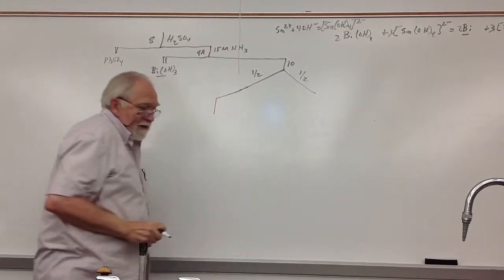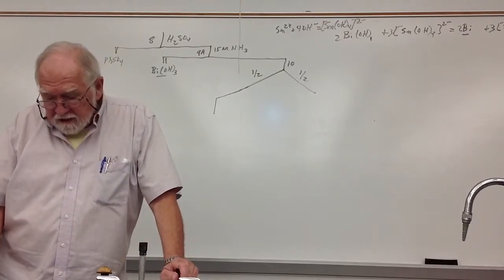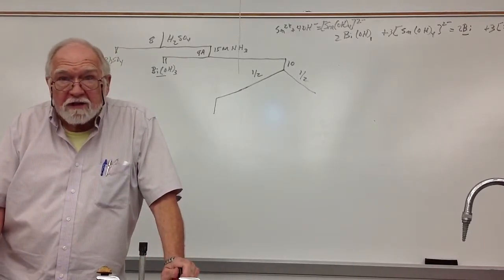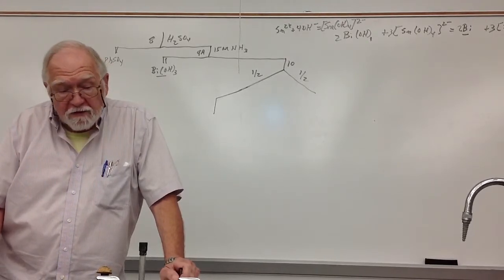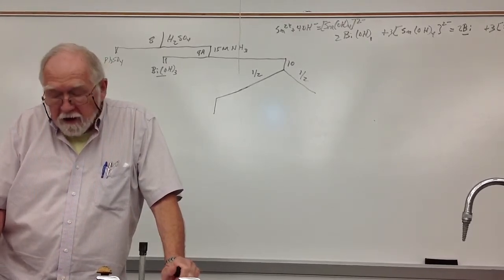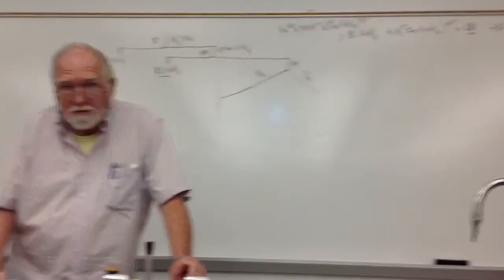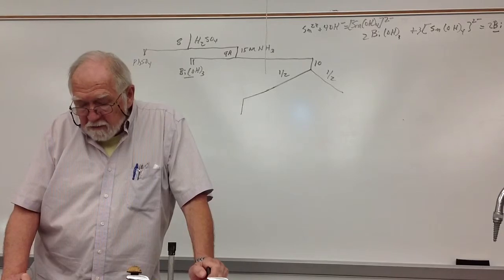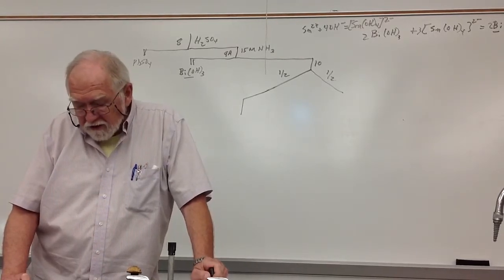And then he goes through a rationale, I'll come back to it. But this test, the blue color already is a pretty sensitive test. In other words, you get the dark blue when you make the tetramine complex for the copper. But if you have a trace, you might not notice it so much. So this test is even more sensitive for copper than the blue color.